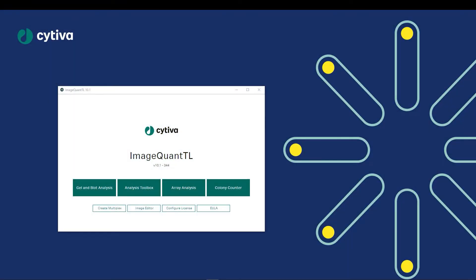In this ImageQuant TL version 10 tutorial video, we will be performing a multi-channel gel or blot analysis with total protein load being used for normalization.